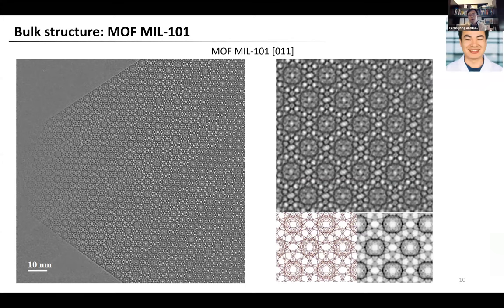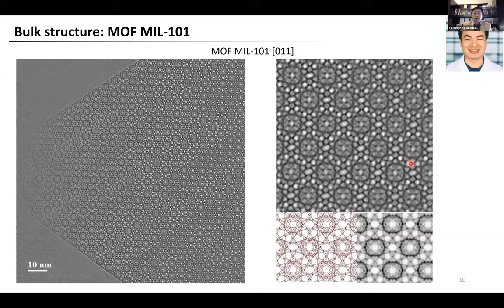We also studied the crystal surface of MIL-101, following the same logic — starting with the bulk structure to confirm safe imaging conditions. MIL-101 has a very large unit cell and very complicated structure. Even so, our image shows a perfect match with the projected structure model. The major structural features, including mesoporous cages, surrounding smaller channels, and chromium clusters, can all be identified in the image, confirming that imaging conditions are safe.